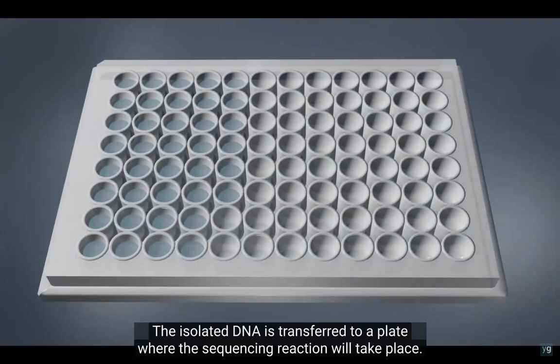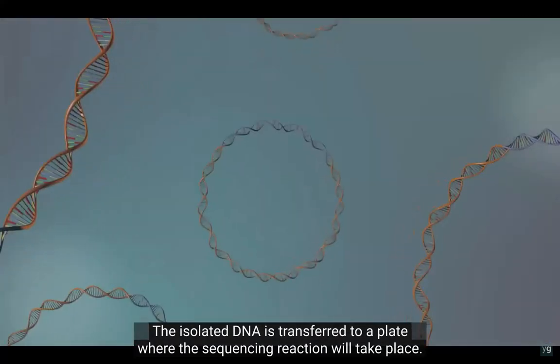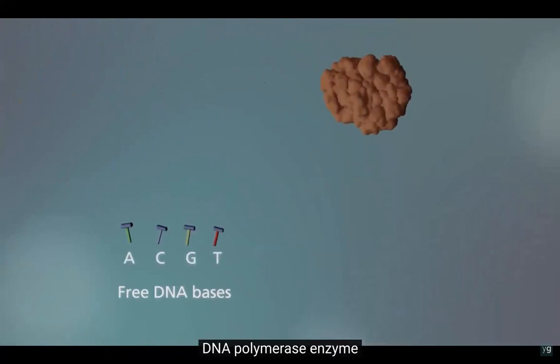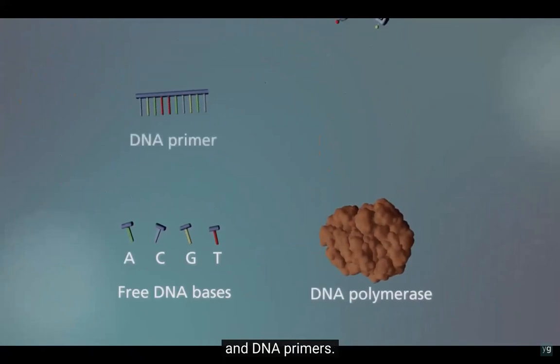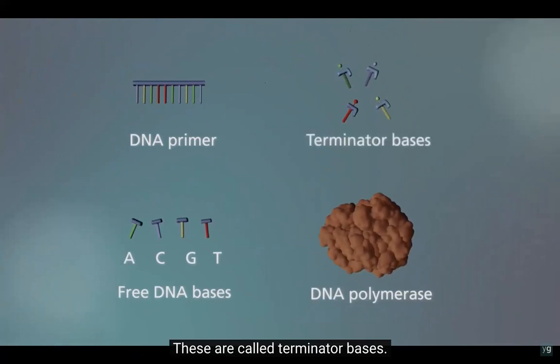The isolated DNA is transferred to a plate where the sequencing reaction will take place. A mixture of ingredients is added. These include free DNA bases, A, C, G, T, DNA polymerase enzyme, and DNA primers. Modified DNA bases labeled with colored fluorescent tags are also added. These are called terminator bases.